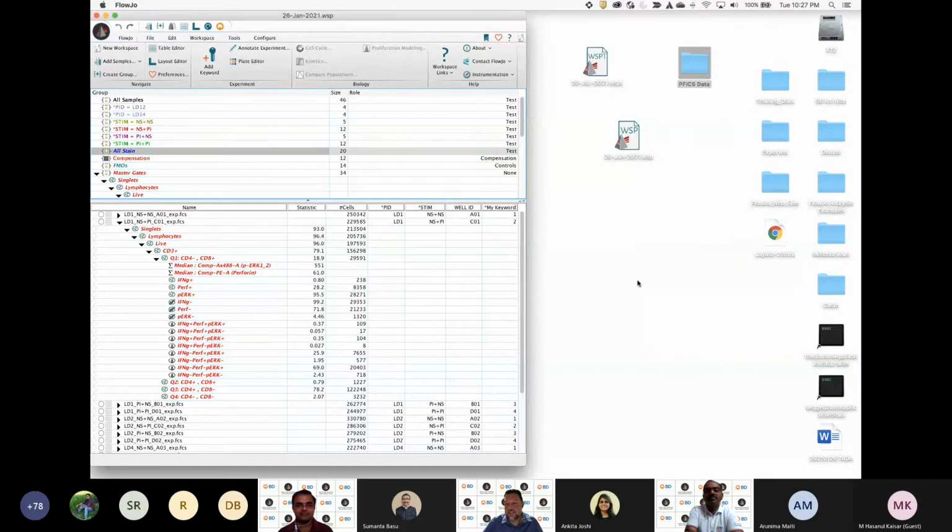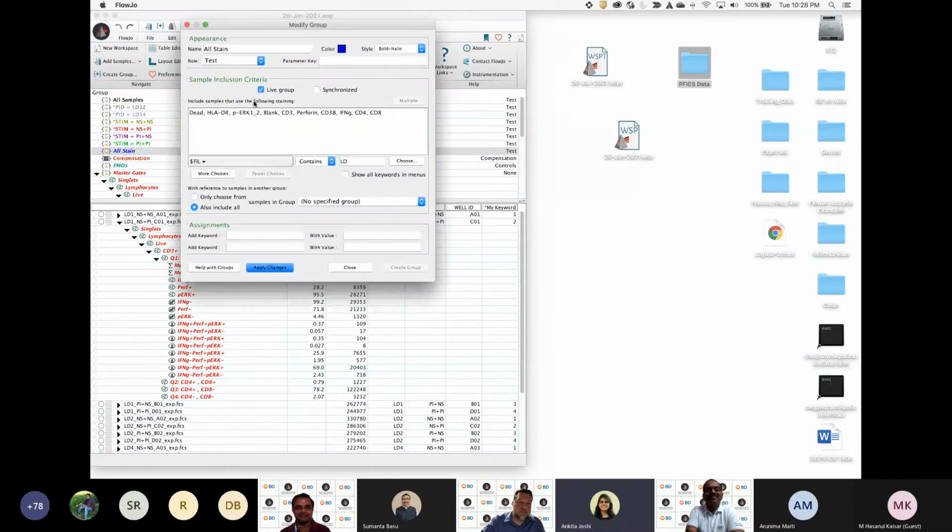Drum roll. Ankita, are we getting responses? Yes, we have 16 responses, 17 for both B and C. Why do they think it will automatically clean up the data? Nancy has mentioned B. We are seeing multiple. So 25% say A, 17.5 we have for B, and mostly we have for D, that is both B and C. I will request, don't rush, just read the answers thoroughly and then decide.